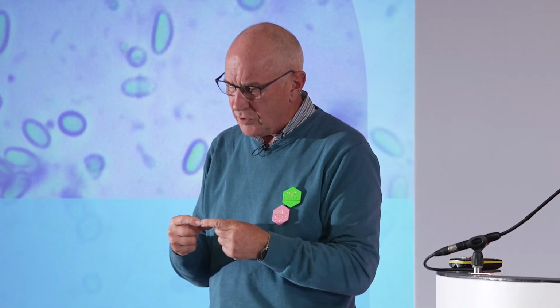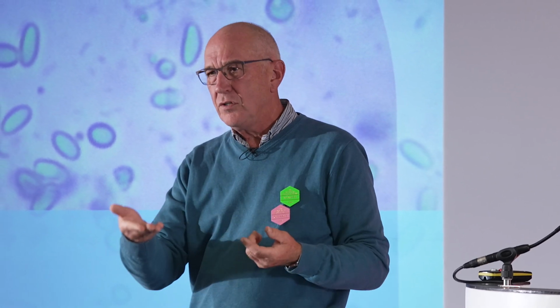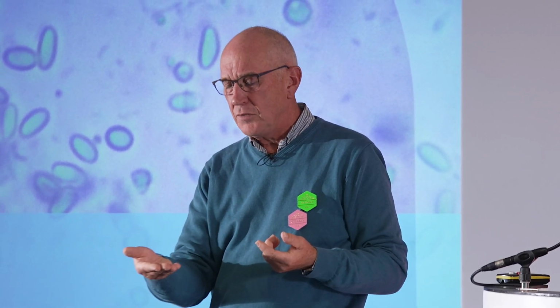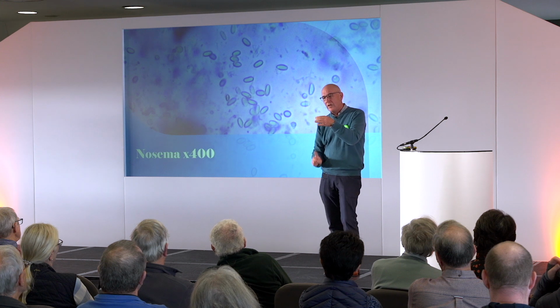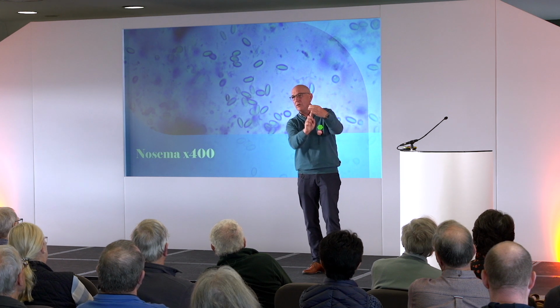So what I do is if I make a slide, I put my slide underneath onto the stage, this mechanical stage, and I get the light going through the middle of the slide, and I do this for everything. I can look at the side and move everything around so I can see the light beam going through the middle of the slide cover slip. I look at that, and then I look down.